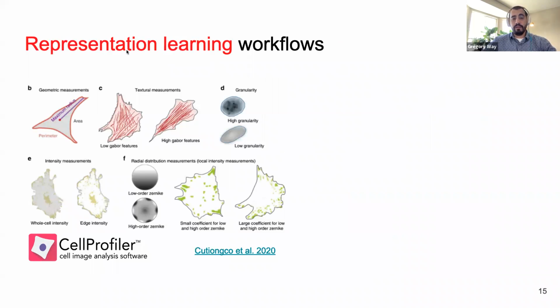So just to discuss more about representation learning, one of the challenges in analyzing microscopy images of cells is there isn't a standard dictionary of features that you can extract from cells, like there is maybe for molecular readouts. So the Human Genome Project produced the sequences of all the genes in the genome. And so now we have those genes that we can hang knowledge on. We don't necessarily have that for cell images. We have things that are kind of close to it, but there are still lots and lots of challenges that is too much to discuss in this one slide.